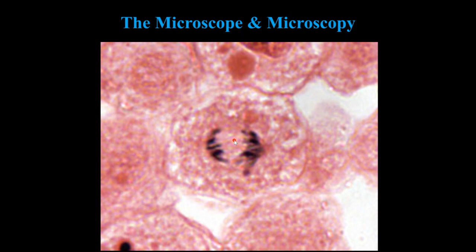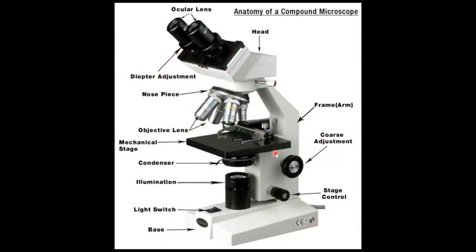Now, the microscope has two adjustments. And where's the other one? All right, this is a little different than the microscopes we have. Ours have two knobs. It has a big knob on the outside called the coarse adjustment, and a smaller knob inside called the fine adjustment.